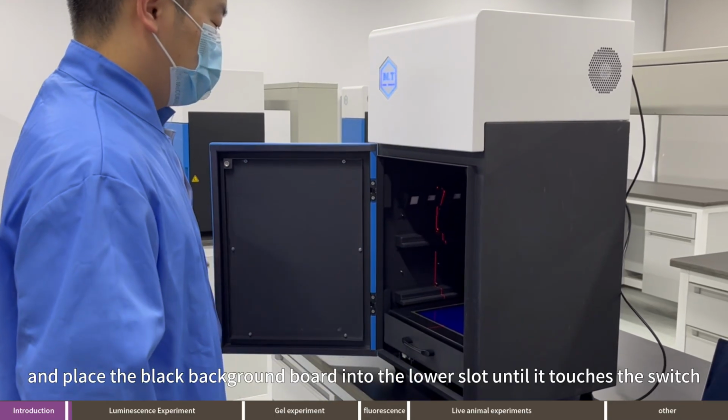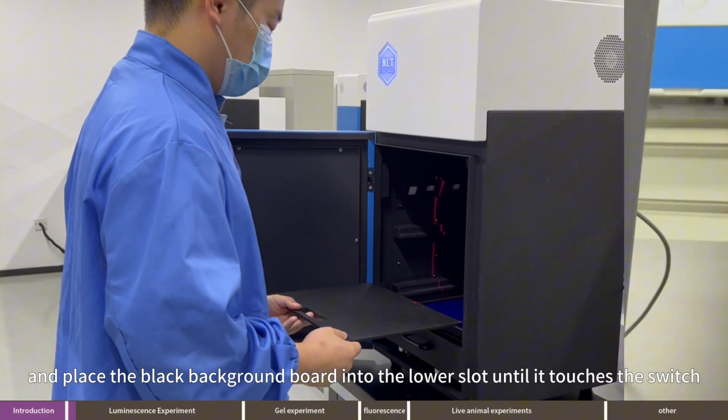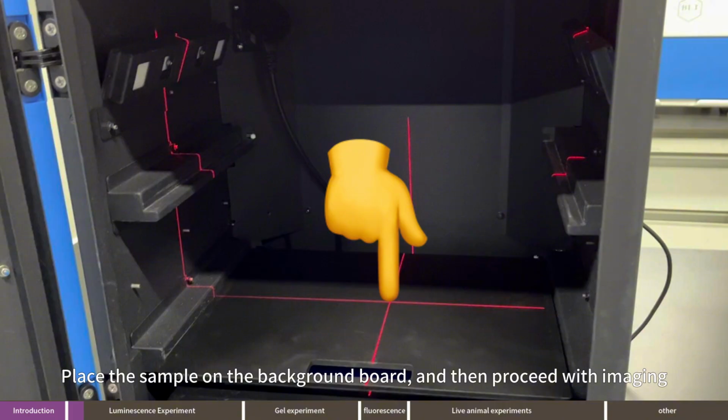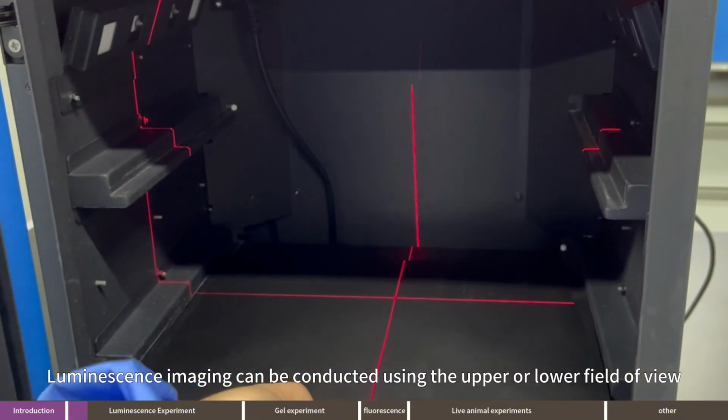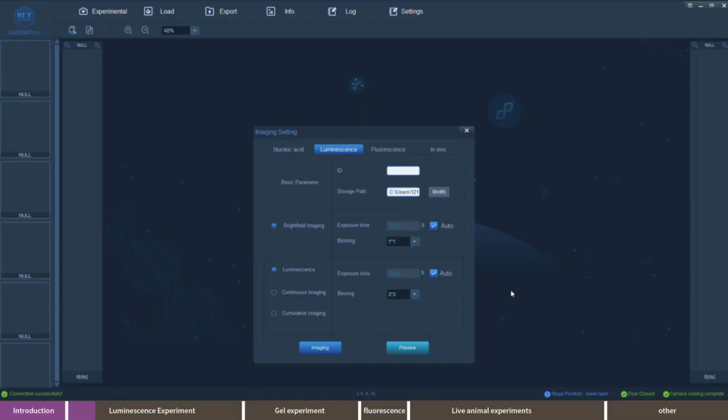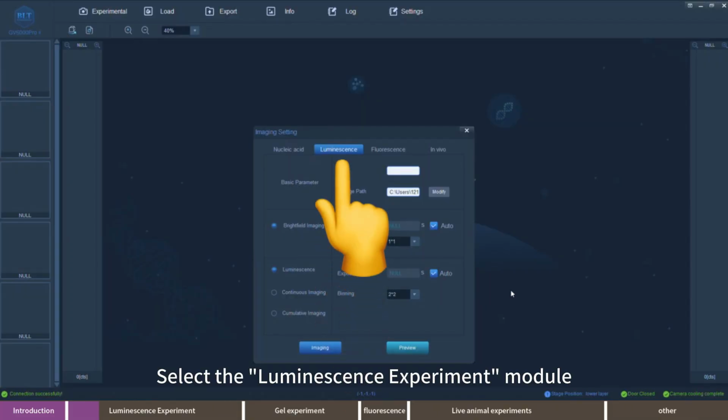Open the door and place the black background board into the lower slot until it touches the switch. Place the sample on the background board, and then proceed with imaging. Luminescence imaging can be conducted using the upper or lower field of view. Select the Luminescence Experiment module.